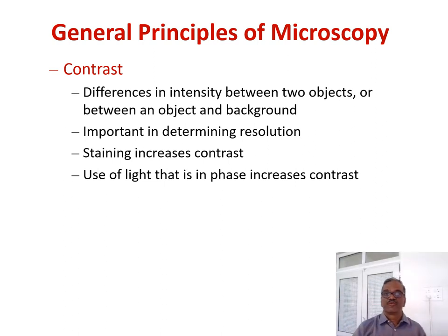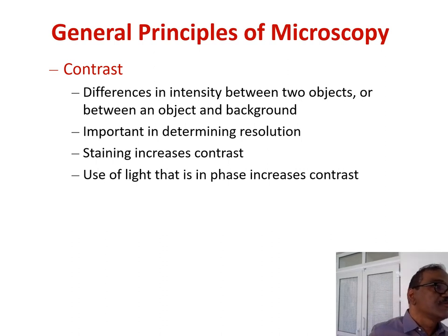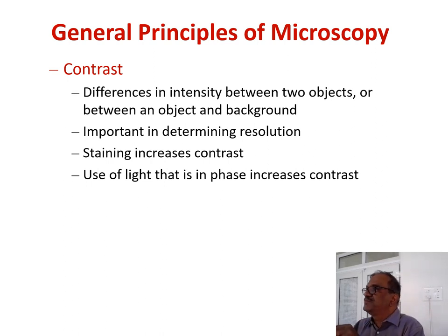The third important principle in microscopy is contrast. Take the last row: two girls sitting, one wearing white and another wearing red. It is quite a contrast, am I right? So easily we can identify there are two persons. If two persons are wearing the same color, then to differentiate is a little bit hard. Same thing here, at a different thickness, a different diameter level, or closeness, we have to find out which object is differentiated from another object at what closeness. Okay, how to create the contrast?